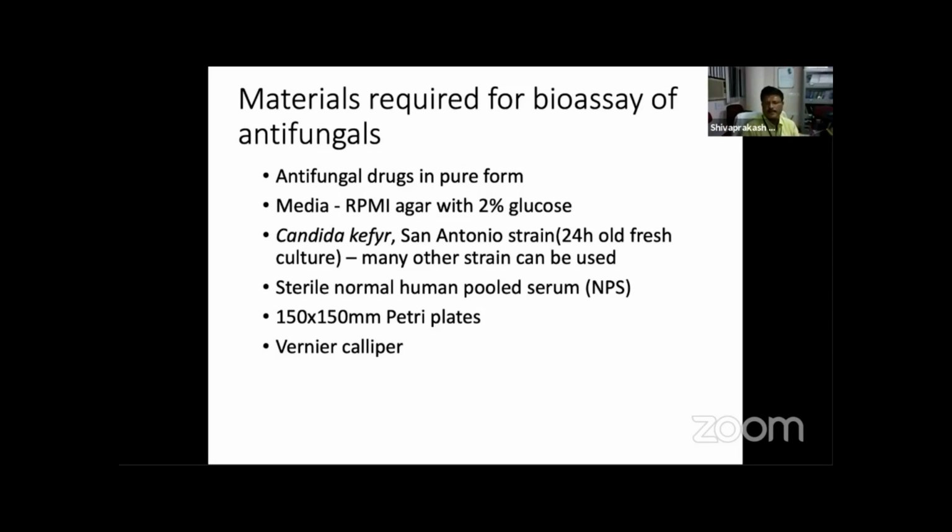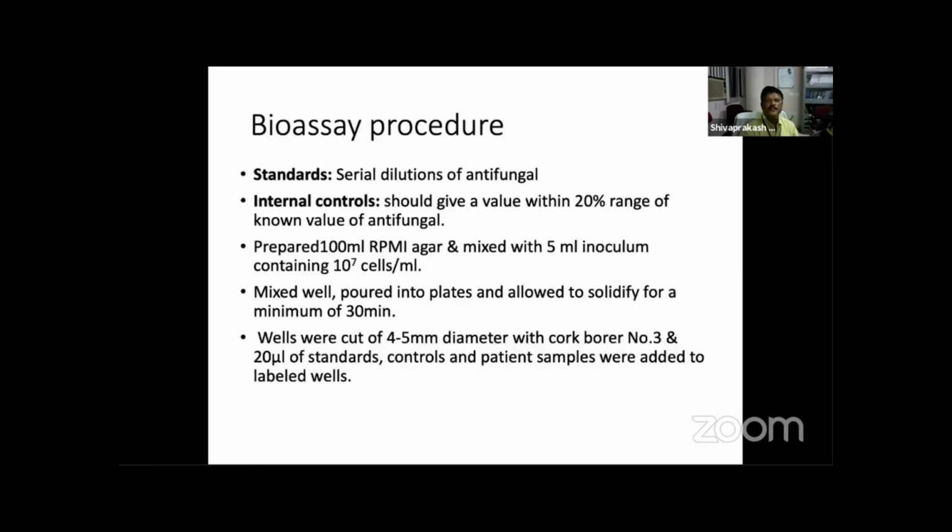Even a plastic tray can be used. And you need a vernier caliper for measuring the zone of inhibition.